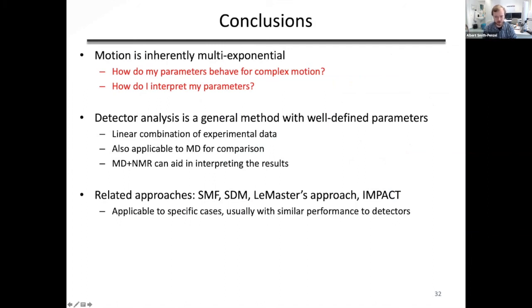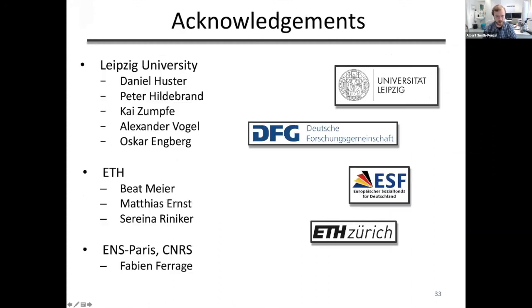I presented the detector analysis, and I just want to mention that the difference between these related approaches and detector analysis is that detector analysis is generally applicable, whereas these need to be applied to specific cases and specific data sets. I've been working on this since my time at ETH, but now of course we're continuing to work on it in Leipzig, where we're in particular working on the lipid analysis.